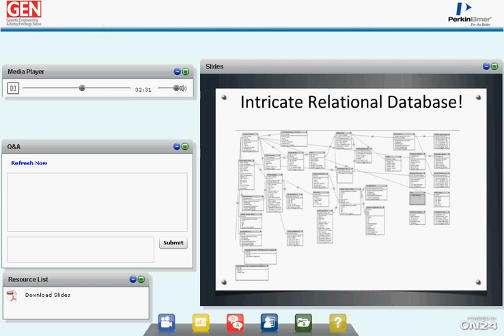And so in our laboratory, we've built sort of a homebrew LIMS system to track all of this. And so you can see all of the different tables and all the different variables that come into the final report. And so this is a huge need in the field, being able to capture all this data. And when we got started, we decided to build our own just because the field wasn't there yet. But as you'll hear in a little bit, there have been advances in terms of the laboratory information management systems that are available that really highlight the importance and equip labs to be able to perform these types of analyses.